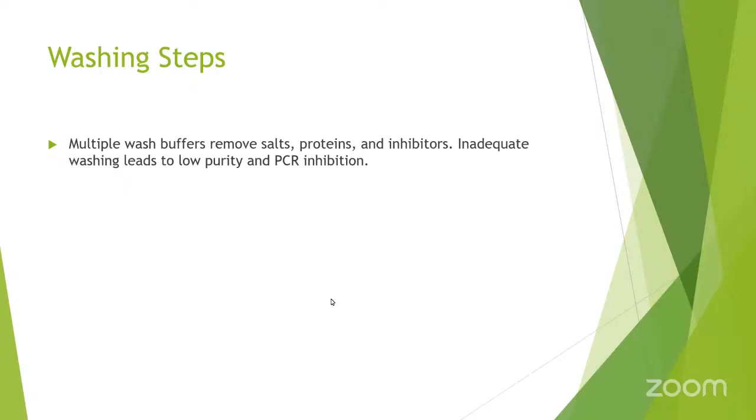The washing steps: multiple wash buffers remove the salts, proteins, and inhibitors. Inadequate washing leads to low purity and PCR inhibition.